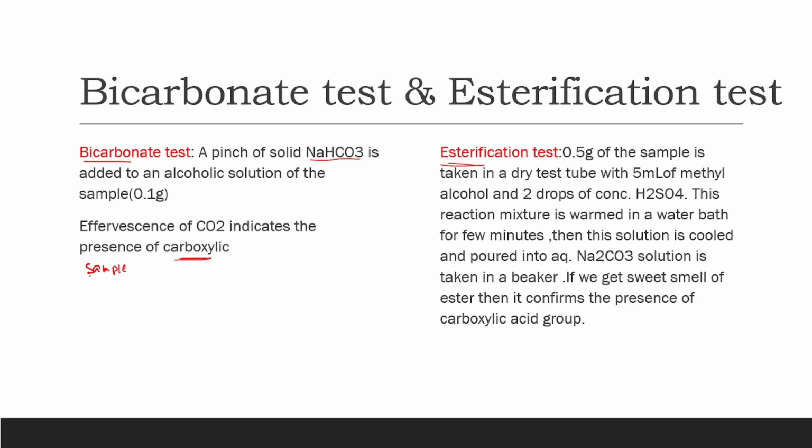I do not know whether in this sample carboxylic acid is present or not. If carboxylic acid is present, then this carboxylic acid reacts with sodium bicarbonate to form carbonic acid and the sodium salt, C double bonded O single bond O Na. And this carbonic acid will break down into water and CO2.